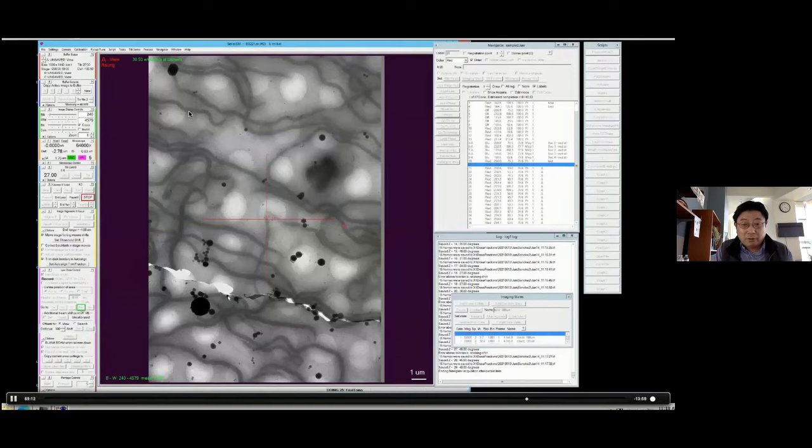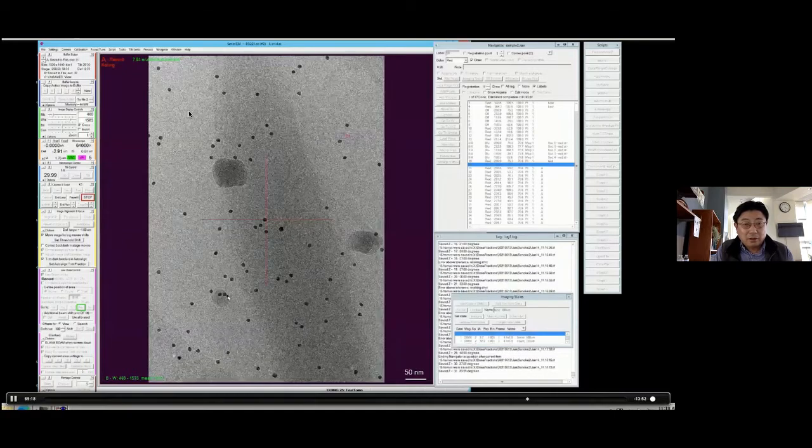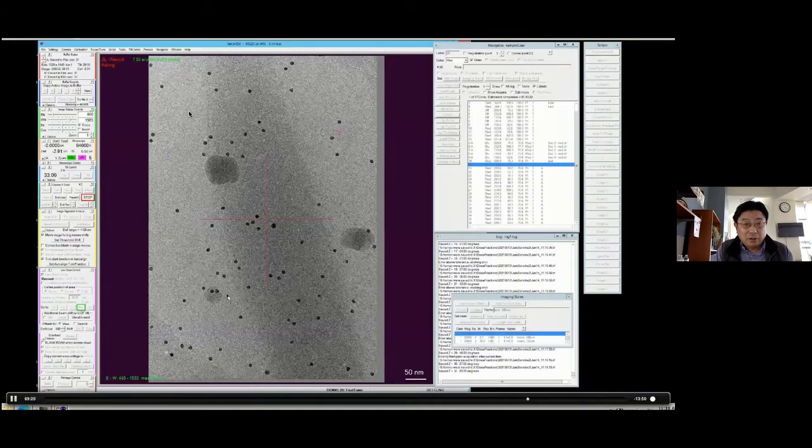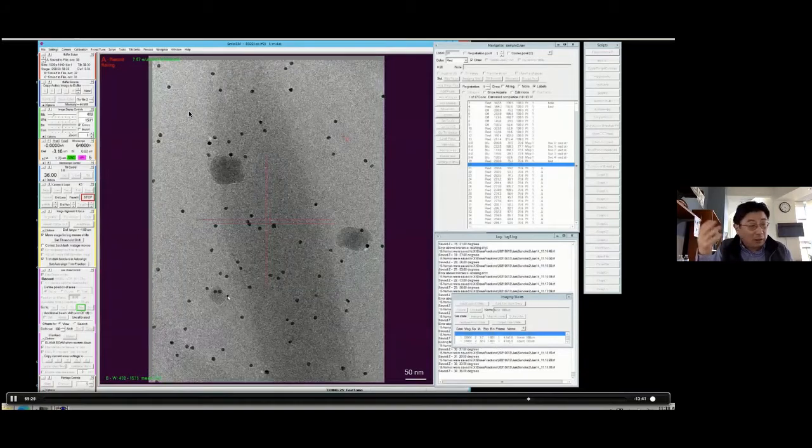Thank you. The next question says, thank you for a nice demo. Please advise, is it really needed to optimize the ratio of gold particles to sample while making the sample? Oh yeah. Typically the gold comes from the same source, so you roughly know the concentration already.